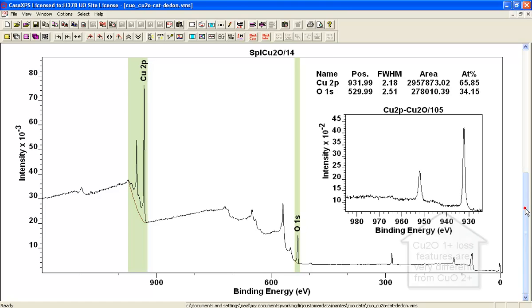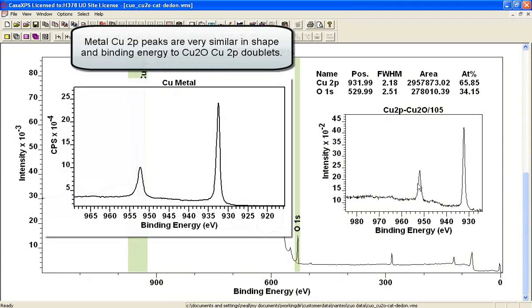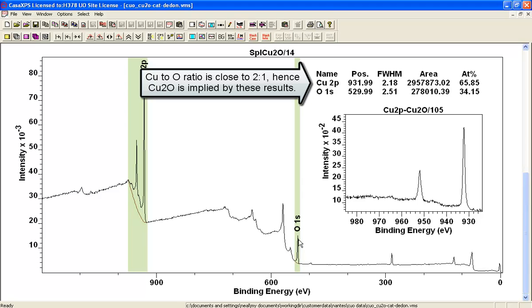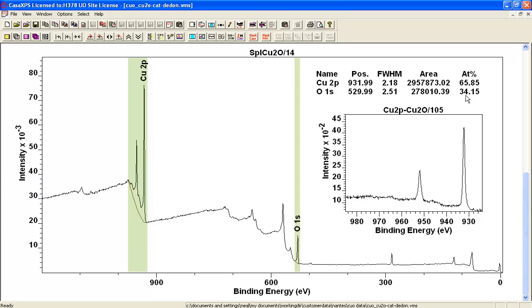Similarly, if we look at a standard material for a copper 1+, then we have, again, a doublet here, very characteristic and very different from the 2+. And looking at the ratio of these regions, and we're applying the same background and the same sensitivity factors, so we're trying to do a fair test, you can see here that the copper is much more than the oxygen, and it's about 2 to 1. So this is the copper 1+, and that's consistent with what the sample was.